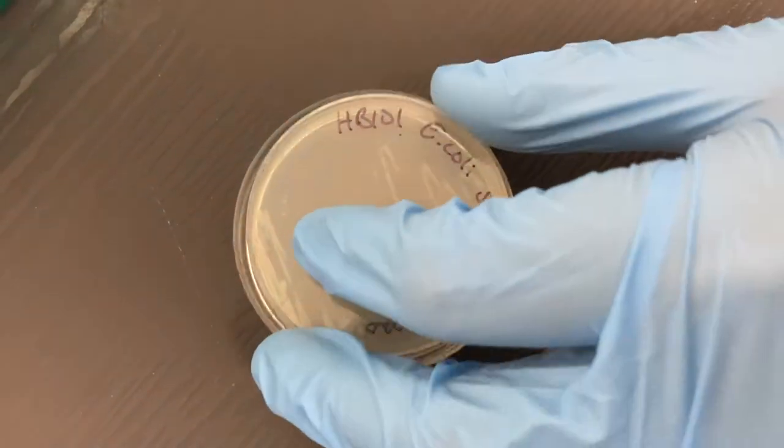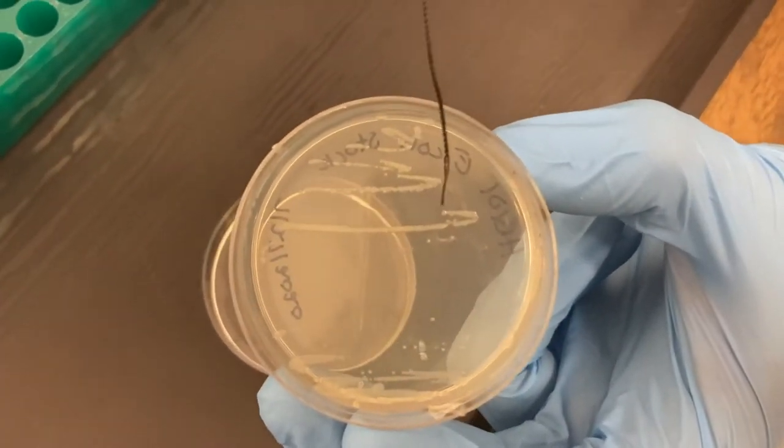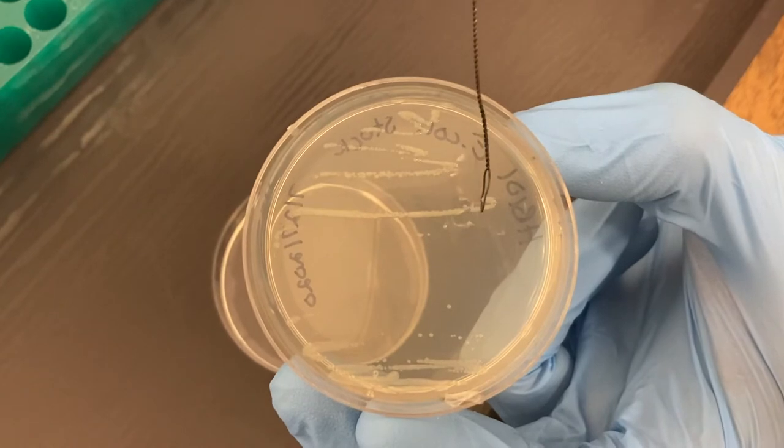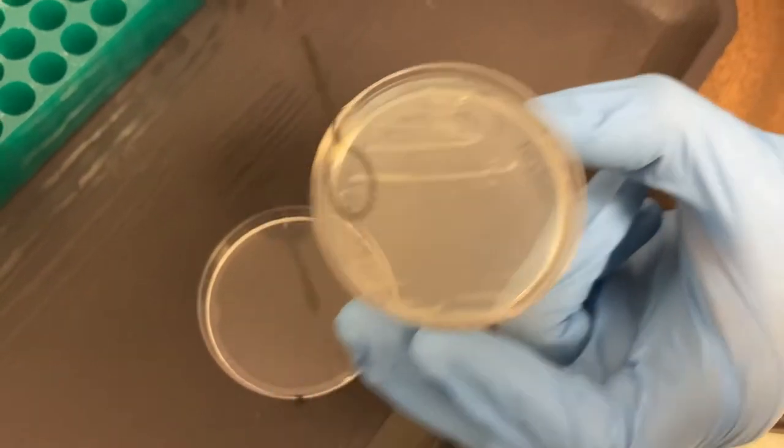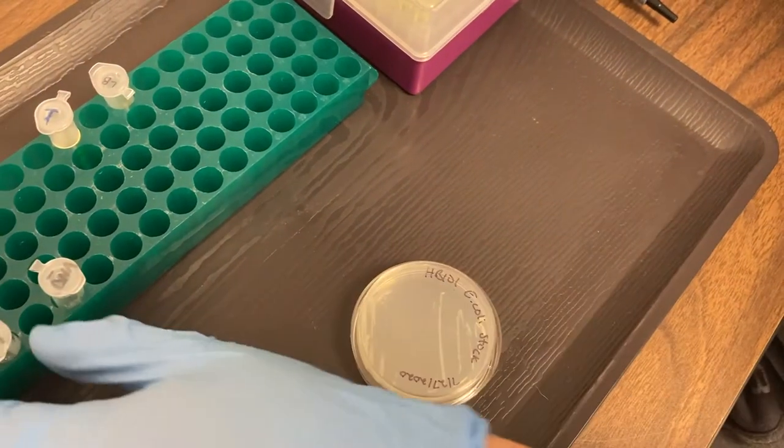Start with our stock of E. coli bacteria. This is what we're trying to get our plasmid into so that we can make the green fluorescent protein. We use this inoculating loop to swipe across the top of the agar, get a little bit of bacteria off there.